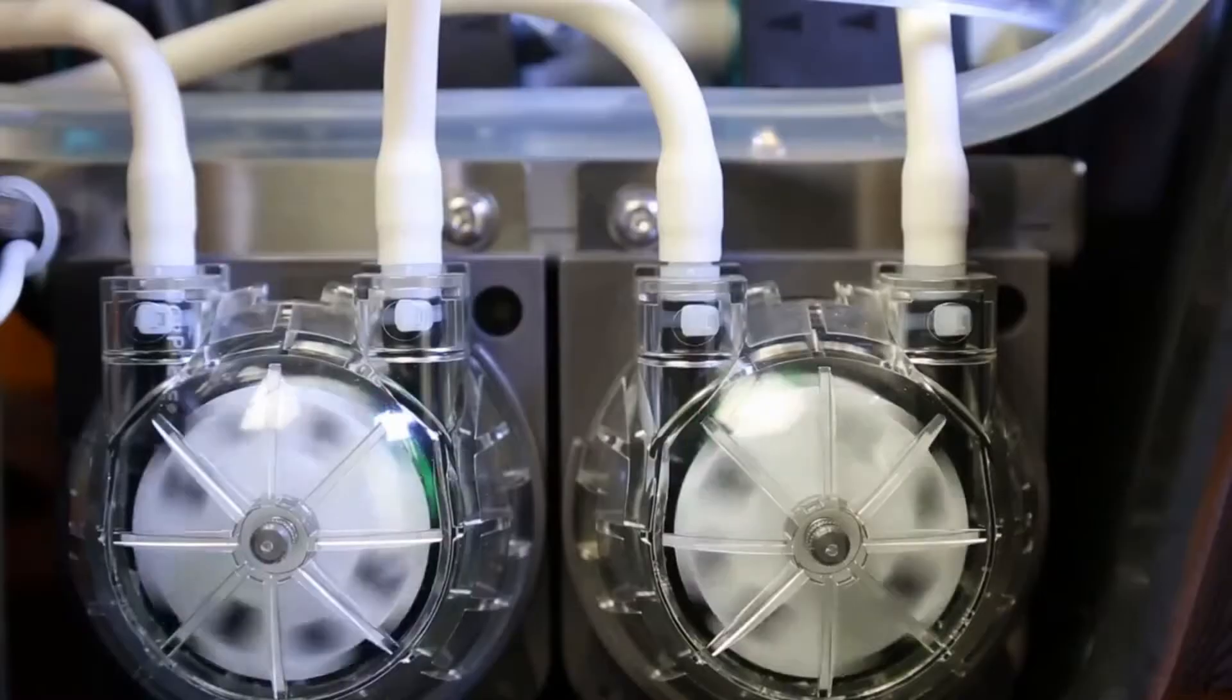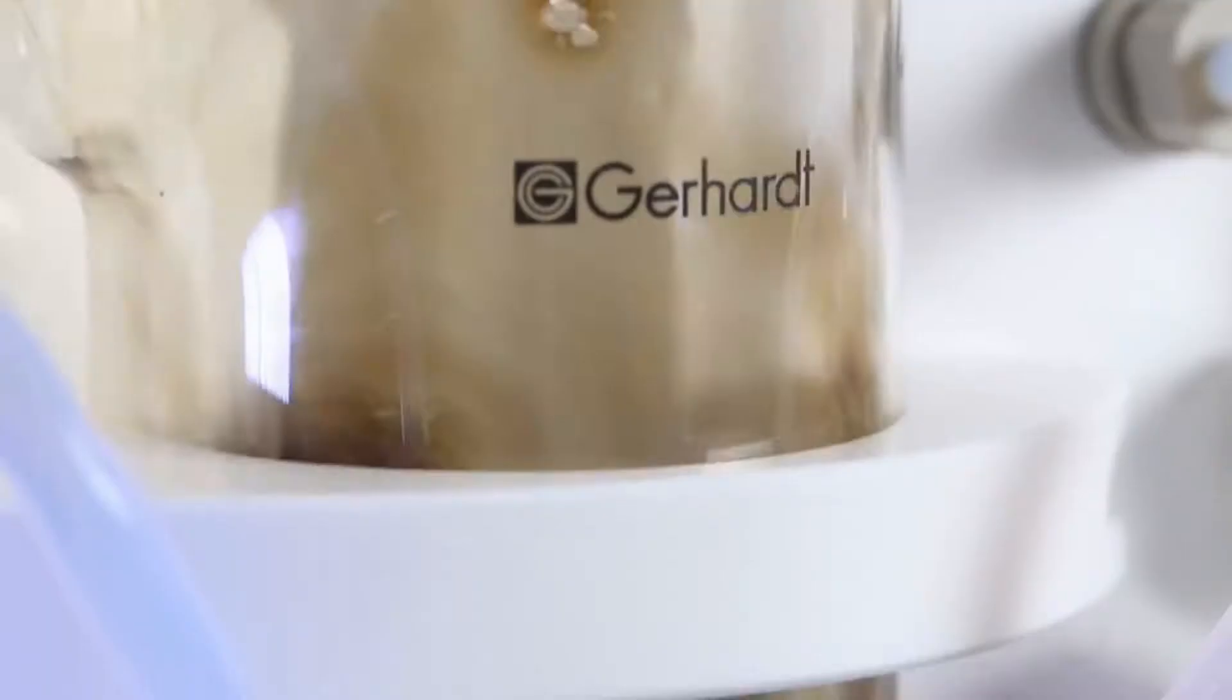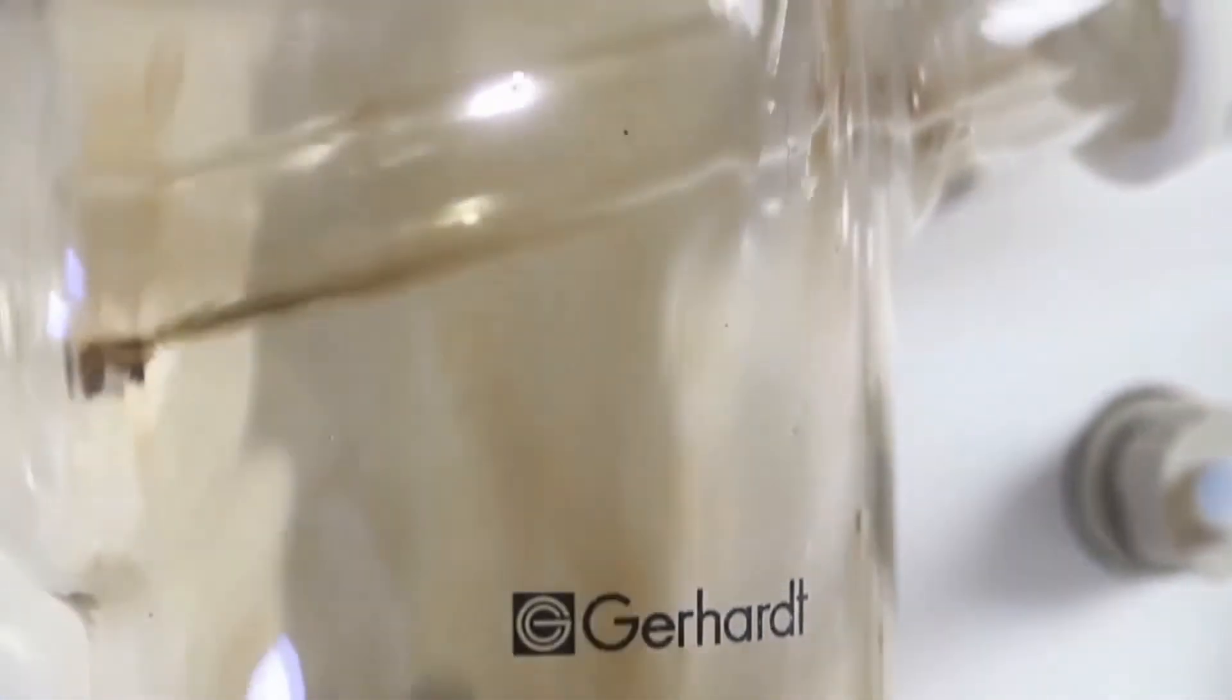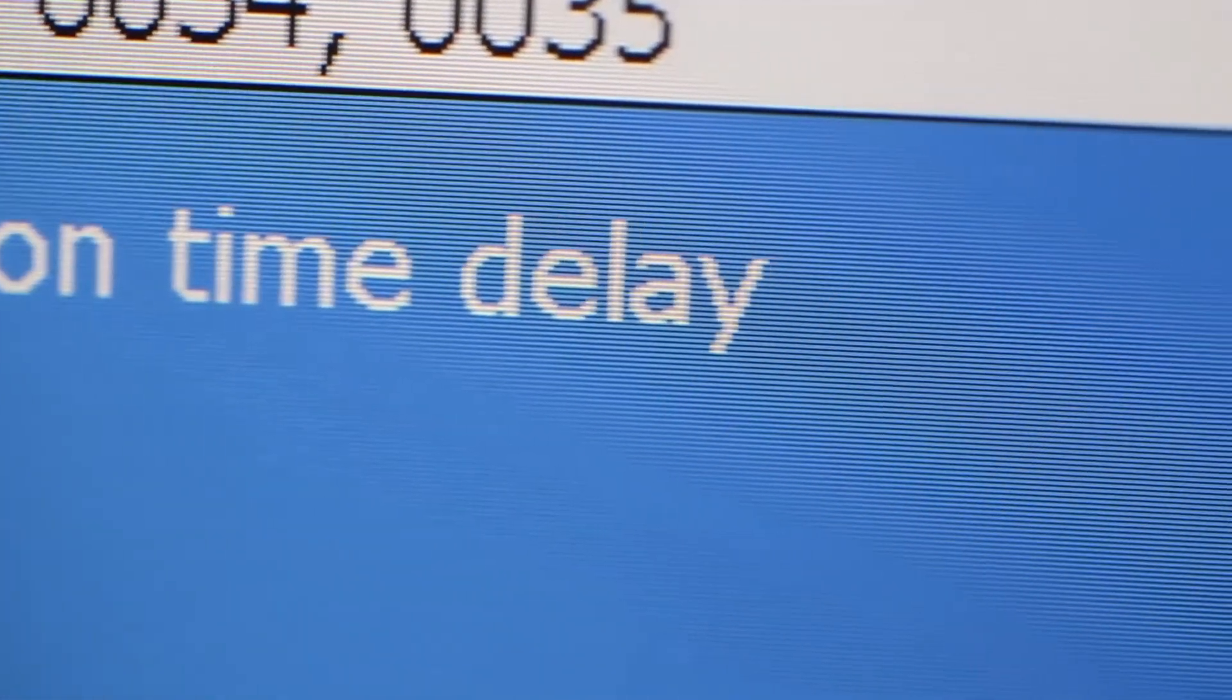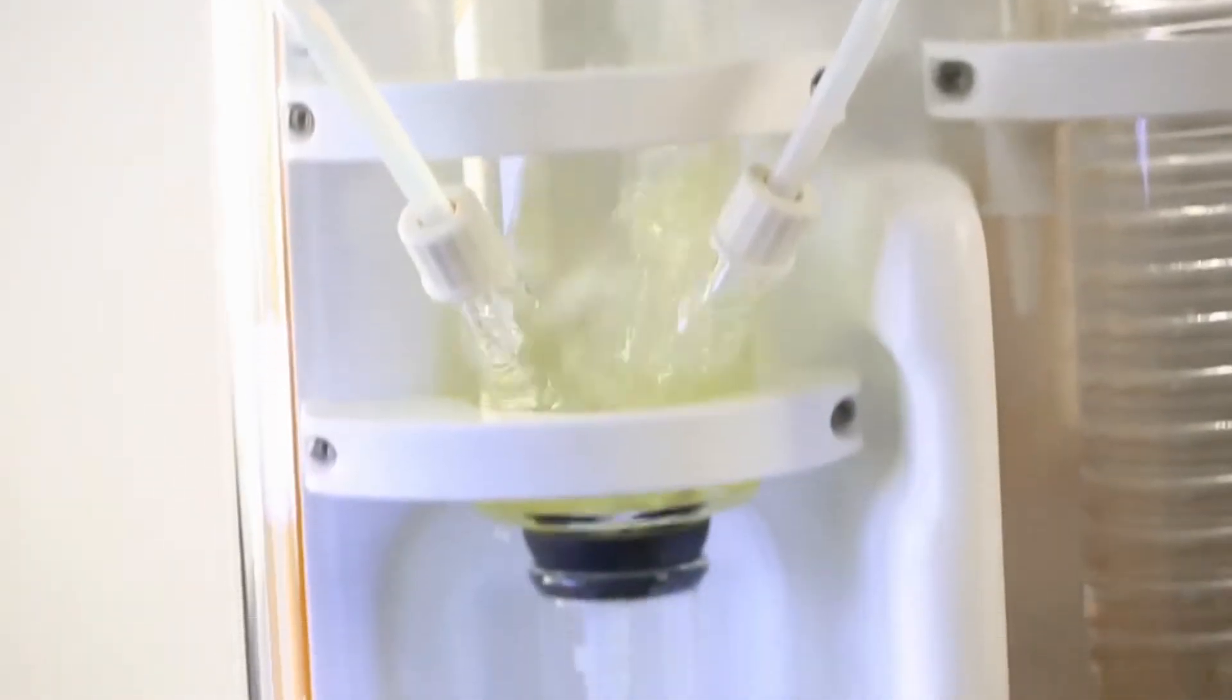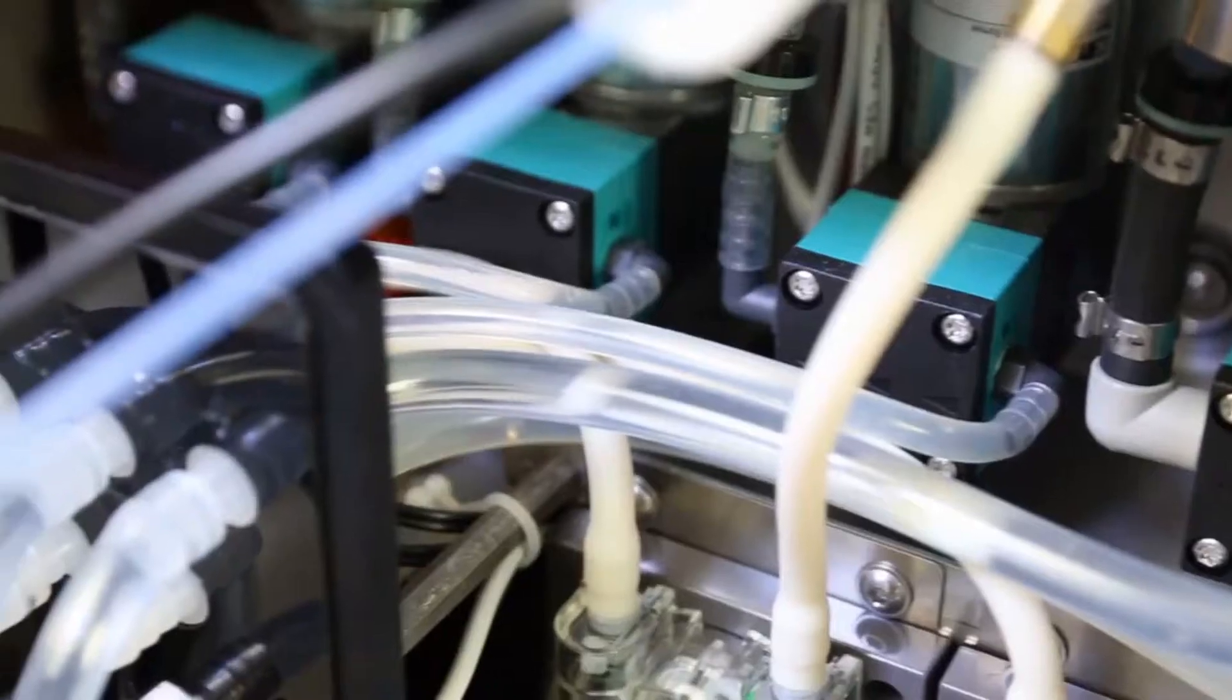Precise pumps control the addition of reagents with maximum exactness. The steam pressure can be fully adjusted from 10 to 100%. The unique programmable soft start function prevents strong reactions.